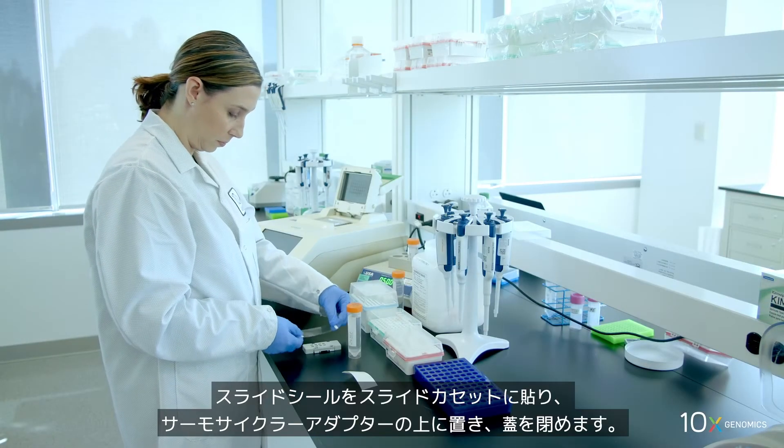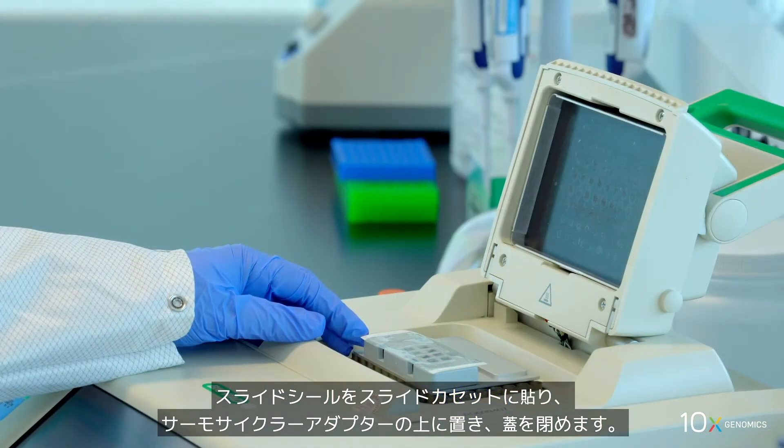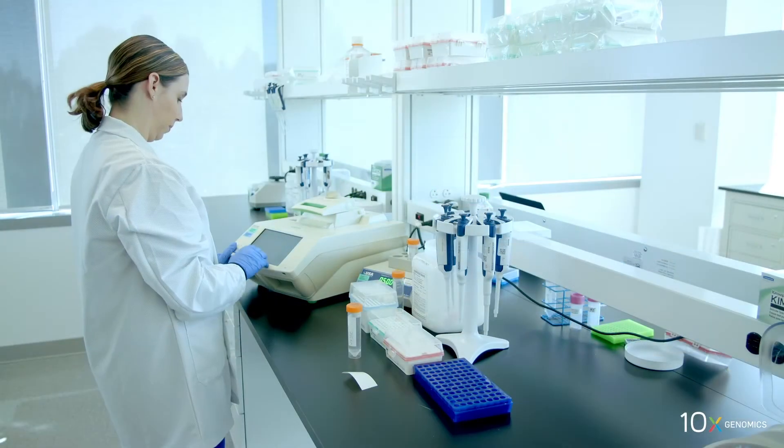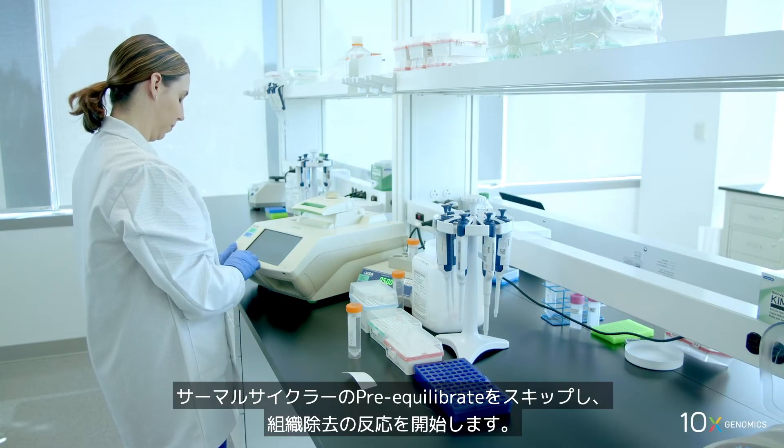Ensure uniform tissue coverage. Apply the slide seal on the slide cassette and place on the thermocycler adapter. Close the thermocycler lid. Skip the pre-equilibrate step on the thermocycler to initiate tissue removal.